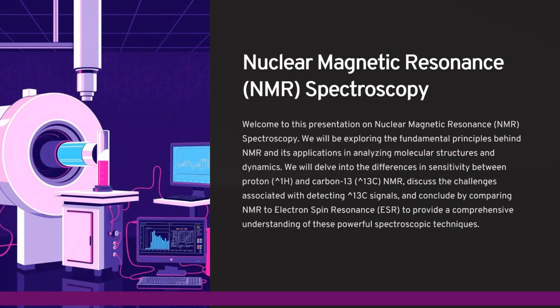Welcome to today's lecture on energy measurements in nuclear magnetic resonance, NMR spectroscopy. In this session, we will explore the basic principles behind NMR and how it is used to investigate molecular structures and dynamics. Specifically, we'll look at how proton NMR and carbon-13 NMR are used to study organic compounds. A key focus will be on the differences in sensitivity between proton and carbon-13 NMR signals.